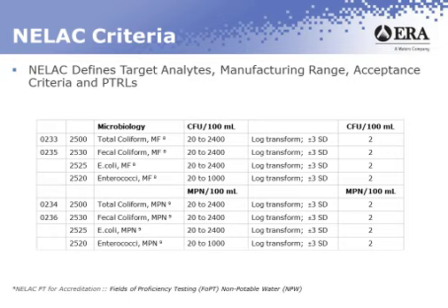Now also on this table you have a design range that's given for each of the analytes. This is a range that the PT providers will target for each of the lots that they manufacture. It's required for us to vary it from study to study over the studies that we produce in a given year. So you can see that the range is 20 to 2400.